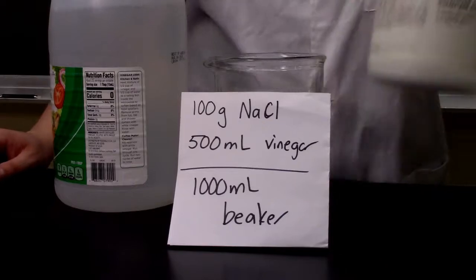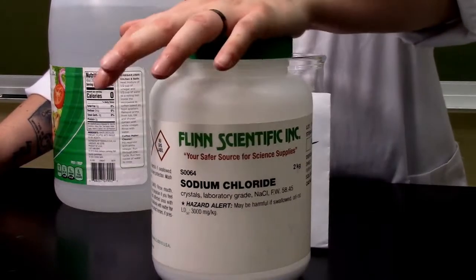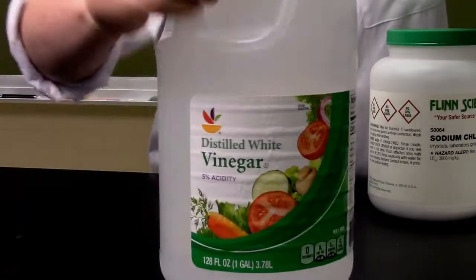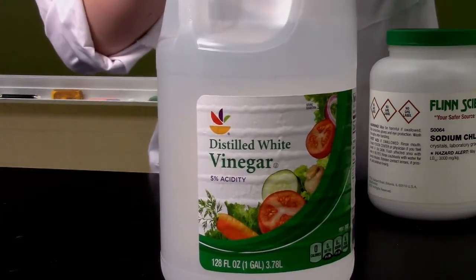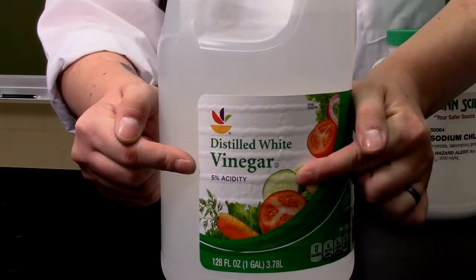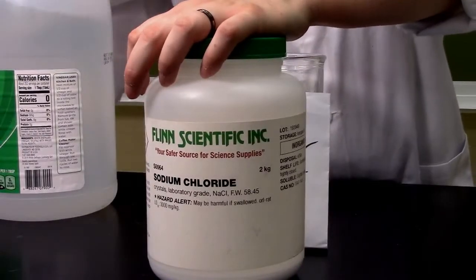The materials I'm using are chemical grade sodium chloride. So notice I'm not just using a container of table salt I can buy in the grocery store this time. But I am just using regular old vinegar in this case that I did buy from the grocery store. So y'all, if you ever hear the term acetic acid, it's the same thing as distilled white vinegar, which is an acid. So we're gonna use this acid and this salt to clean our pennies.